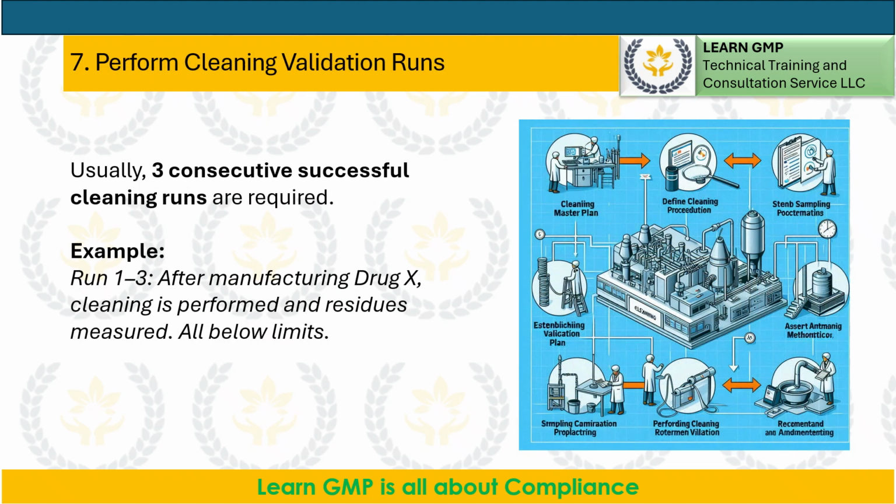Perform cleaning validation runs. To execute the cleaning validation, usually 3 consecutive successful cleaning runs are required. Example: runs 1 to 3. After manufacturing drug X, cleaning is performed and residues measured, all below limits.